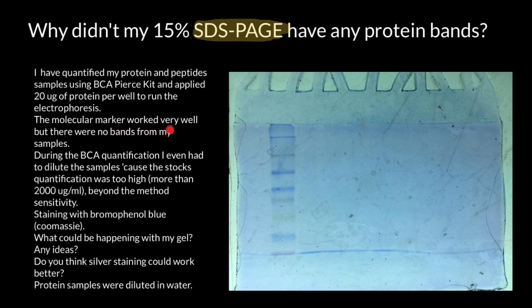The molecular marker worked very well, but there were no bands from my samples. During the BCA quantification I even had to dilute the samples because the stock concentration was too high — more than 2000 micrograms per milliliter, beyond the method's sensitivity.